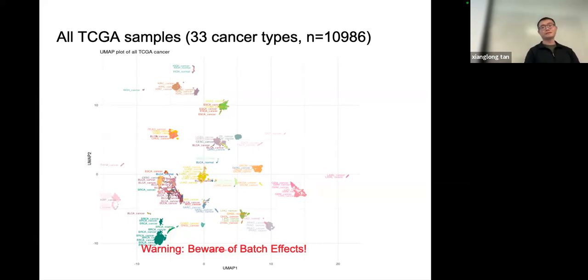This has happened because of the so-called batch effect, which means there could be multiple reasons, such as different technicians doing the experiment at different times. It could be generated with different kits, with different versions, or their normalization standards are different, etc. Sometimes it's hard to get rid of this batch effect. So every time we run this UMAP, we probably need an additional function to check if our UMAP result has gotten rid of this batch effect. So the PCA plotting will be a good illustration.